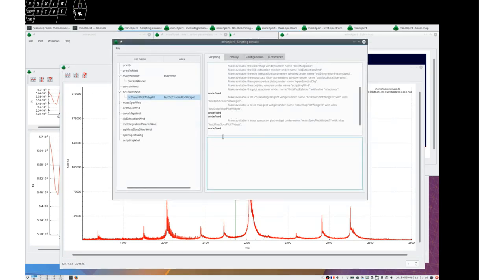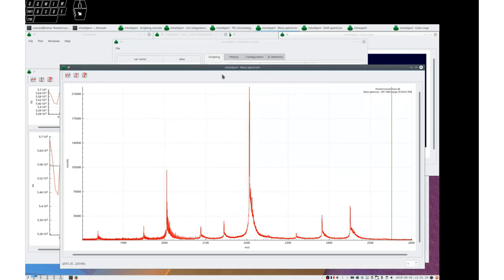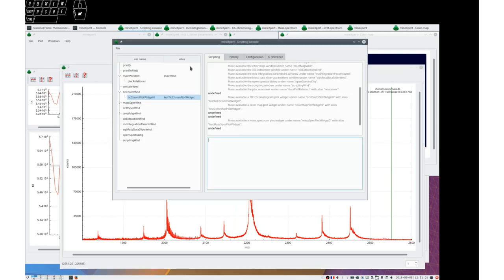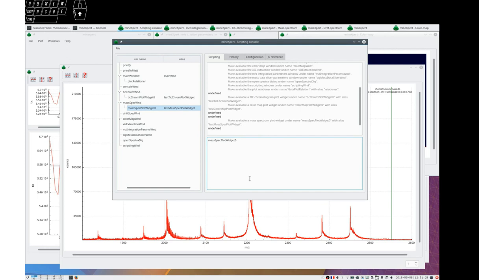And in the mass spec window, which is this mass spectrum window here, I have now a child. I could say Javascript integrate to dt. That is to drift time.